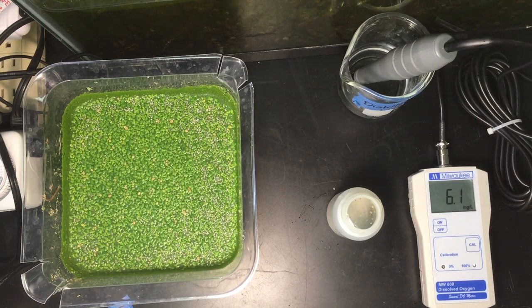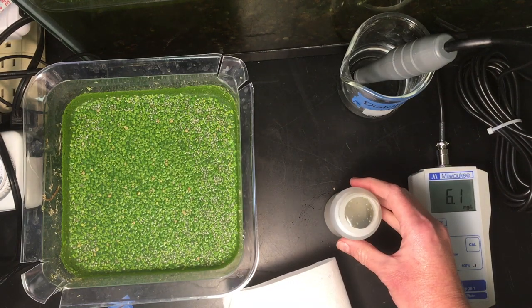So I'm going to put a paper towel under here to catch the excess water as it comes out.